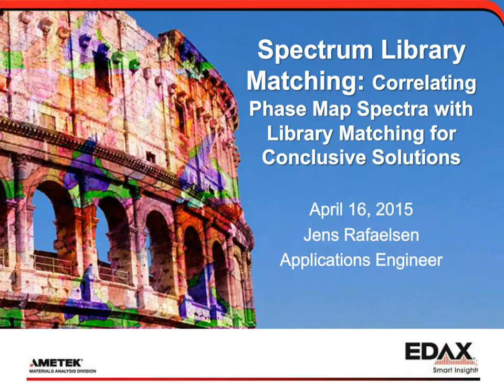You probably had time to look at the intro slide, but just in case you didn't realize, this is a webinar on Spectrum Library Matching, correlating phase map spectra with library matching for conclusive solutions. As I said, I'm an applications engineer with EDAX. My background is primarily in surface science and optics. My PhD is in physics.